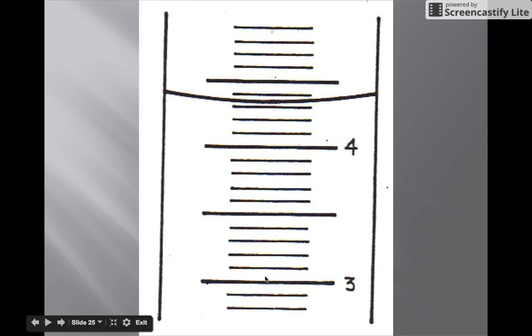I'm going to look at the white space here, not the black lines, but the white space is what represents the true intervals. So we have one unit divided up into 10 spaces. So 1 divided by 10 is 0.1, so that tells us that each of these graduation marks is worth 0.1 milliliters.